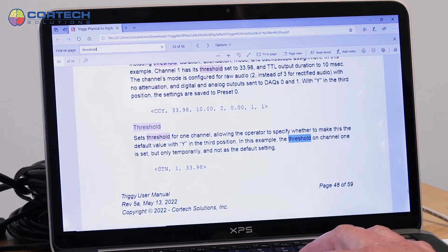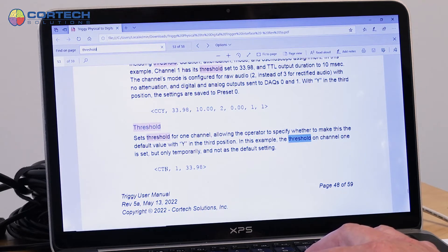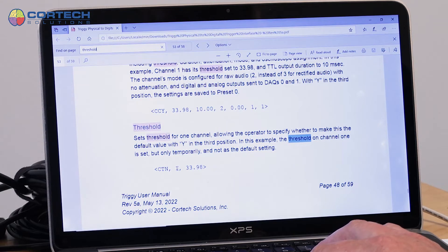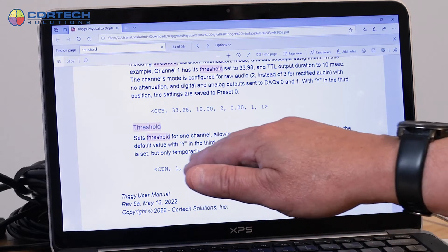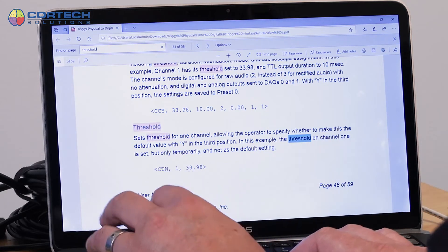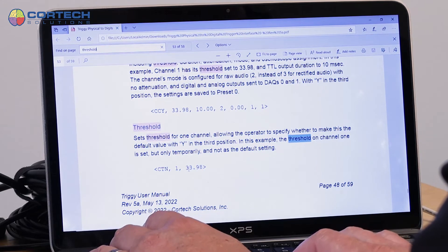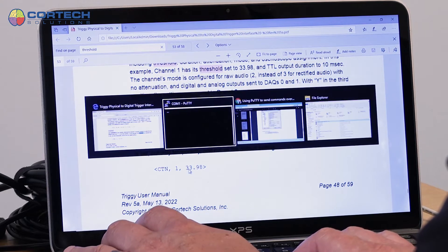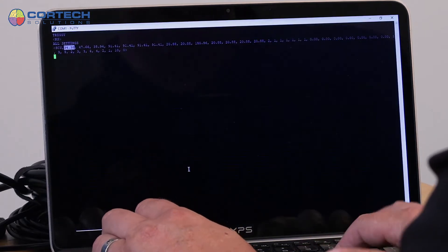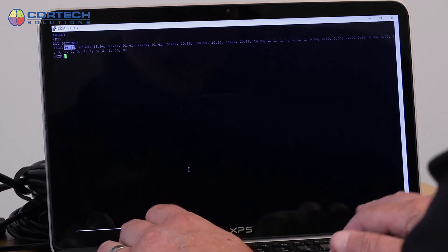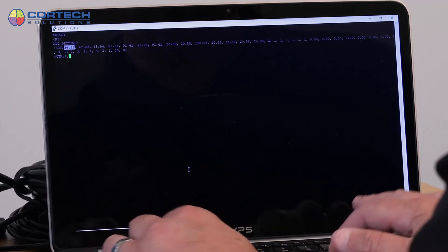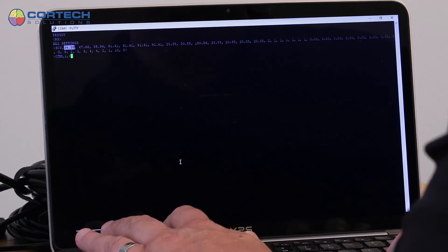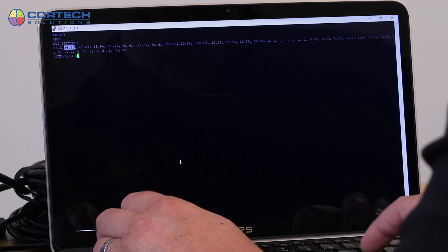And this number, this float is the threshold that I'm setting. So let's try that. So I'll say CTN channel one 33.0.